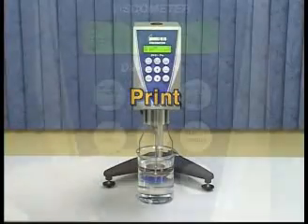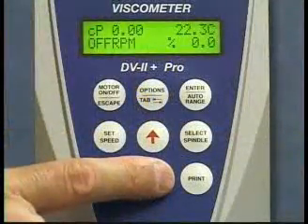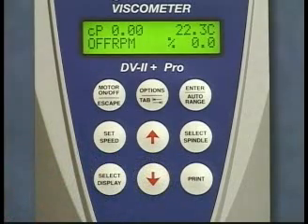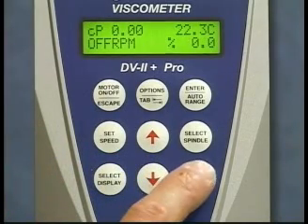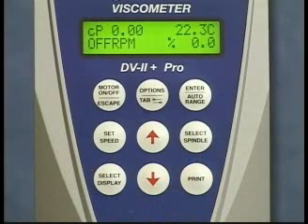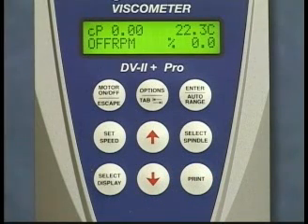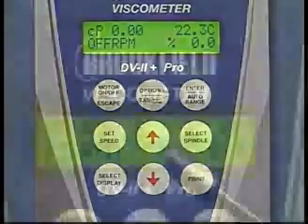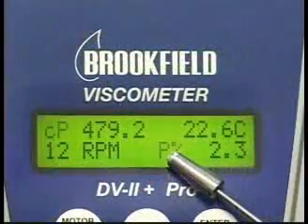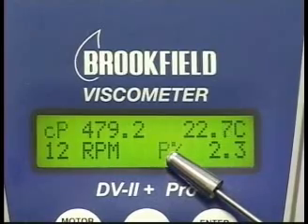Print. The print key selects printing and non-printing modes when a printer is attached to the instrument. Pressing the print key once for less than three seconds results in printing a standard print line. When the print key is pressed for more than three seconds, the instrument will begin continuous printing at a print rate interval selected in the options menu.